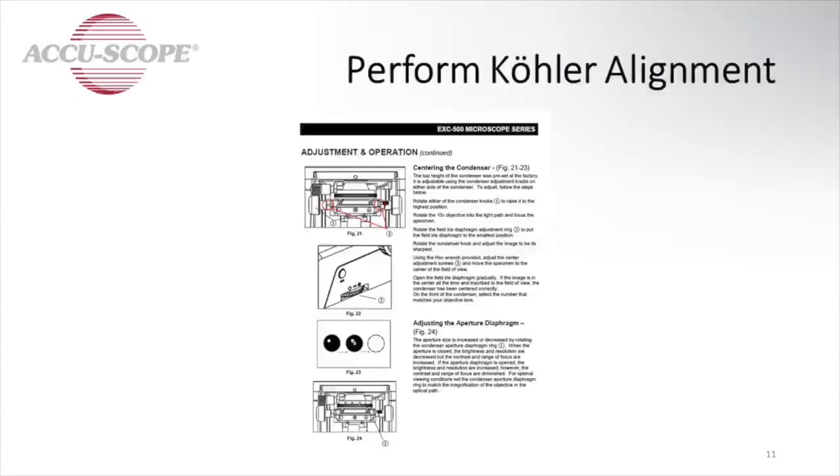Performing Köhler alignment. For optimal performance, you should perform Köhler alignment at the beginning of every microscopy session. Important for even field illumination and maximizing resolution, Köhler alignment includes centering the condenser and adjusting the condenser aperture diaphragm.